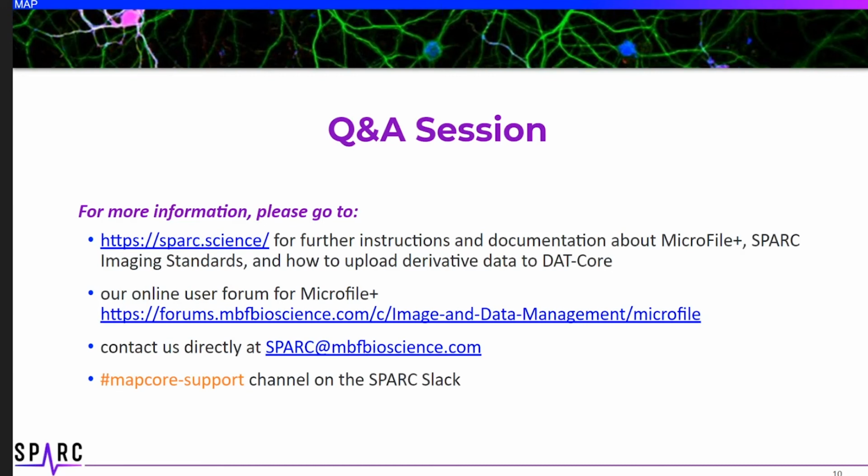Great. Someone else has asked, I have a Huron scanner. Can those files be converted? The answer is yes. They can be. And again, we have support for a lot of different file formats, and we will continually add support for those files. So please contact us.